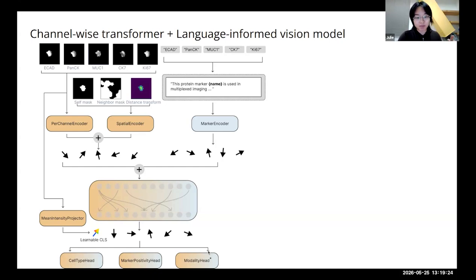The idea here is that across different imaging modalities, there's always some variance that's systematic to those modalities, and we want the model to be more invariant to that. So we want the latent representation of the model to unlearn this modality. And we have some latent space analysis, which I will show later, that proves this to be useful.